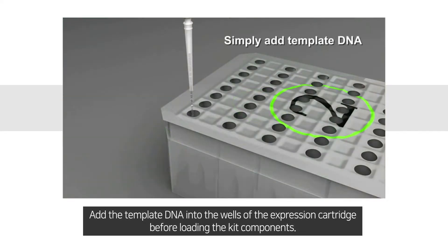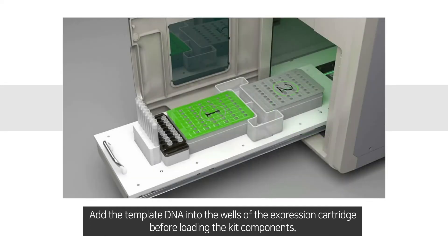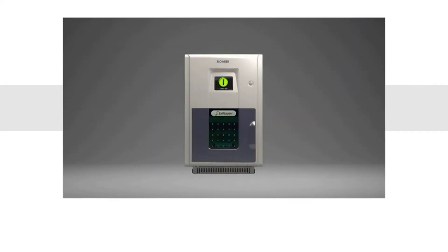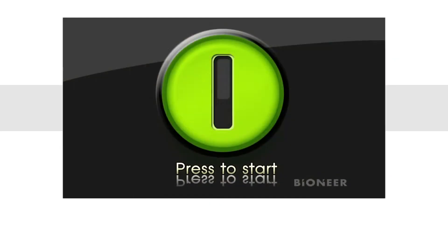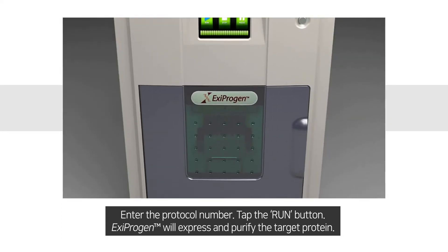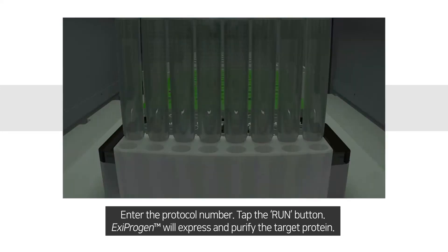Add the template DNA into the wells of the expression cartridge before loading the kit components. Enter the protocol number and tap the run button. Ixiprogen will then express and purify the target protein.